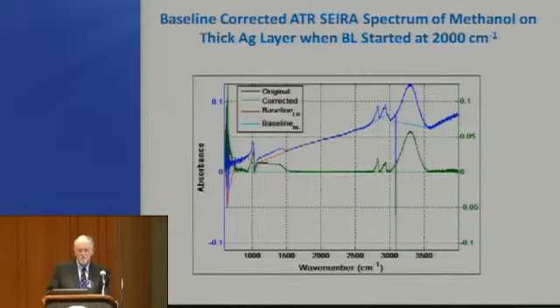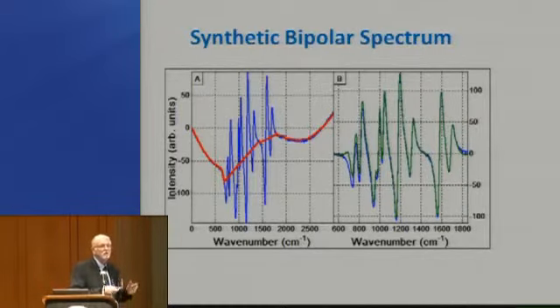We tried this with synthetic spectra, in this case synthetic bipolar spectra, and again you can see that even though the baseline that we put on there was ugly, it handled it pretty well. A little bit of difference at the ends, but not too bad at all.